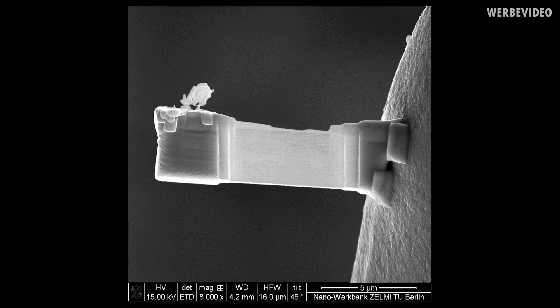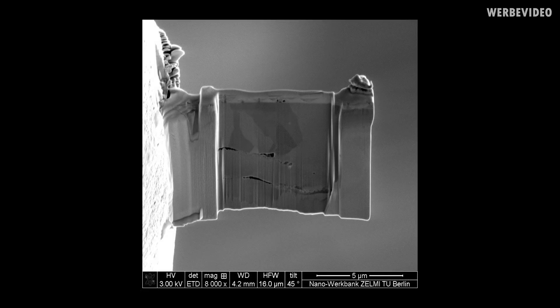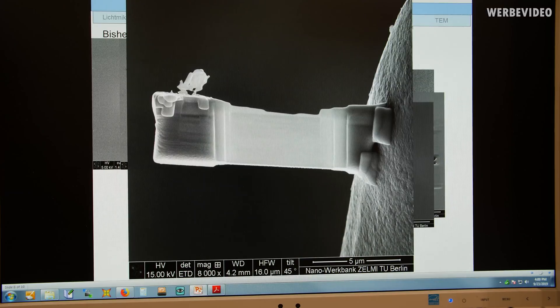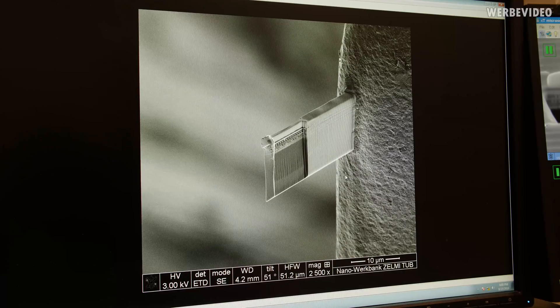In the next step, we use the ion beam again to further thin the TEM lamella to make it transparent for the electrons. So what kind of thickness do we have here final? So the final thickness we have now is 100 nanometers. So if you later want to go to atomic resolution, of course, we need rather thinner specimen. So it depends on the application how thin we will make it now. And you said before it's about a thousand times thinner than a piece of paper, sheet of paper.